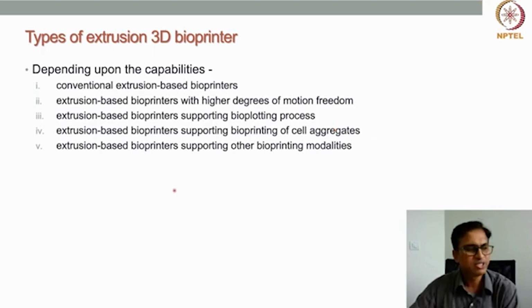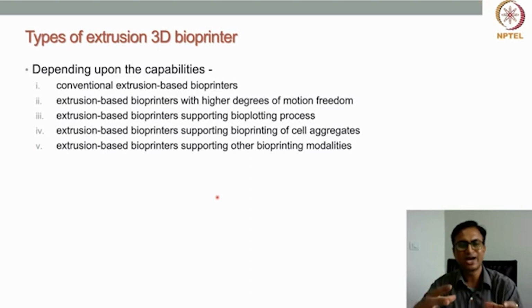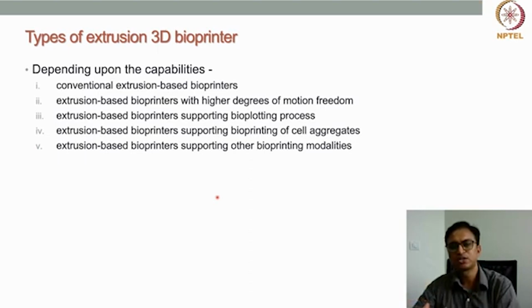And then there are other bioprinters where it is not only extrusion-based bioprinting, but other kinds of bioprinting modalities are also attached. So it is a kind of hybrid bioprinter, where it can work with extrusion-based bioprinting, and some other bioprinting modalities can also be attached.